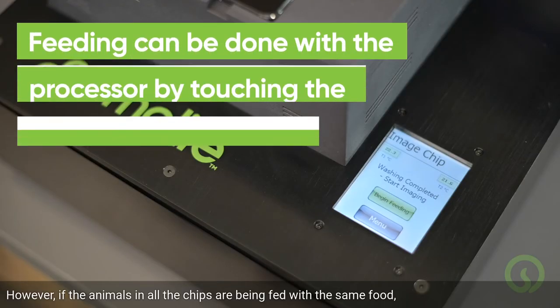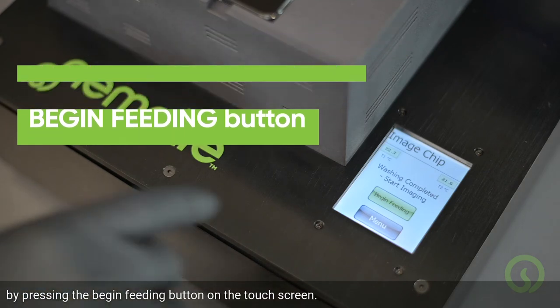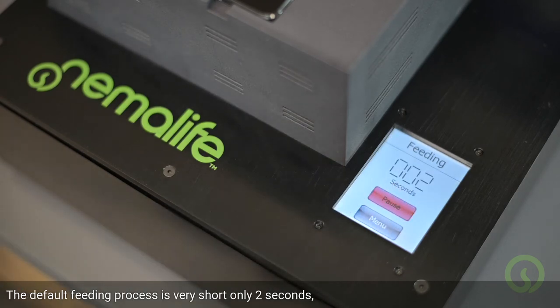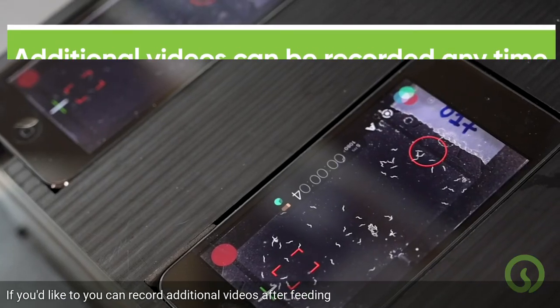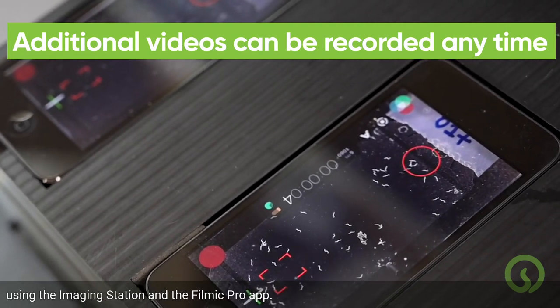However, if the animals in all the chips are being fed with the same food, feeding can be done with the processor by pressing the Begin Feeding button on the touchscreen. The default feeding process is very short — only 2 seconds — but be assured the animals are getting the proper amount of food. The touchscreen will now read Feeding Completed. If you'd like, you can record additional videos after feeding using the imaging station and the FiLMiC Pro app.